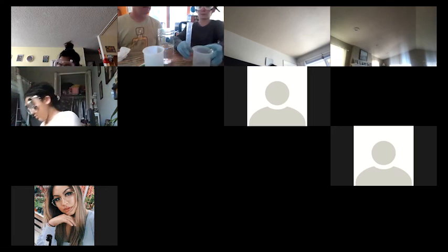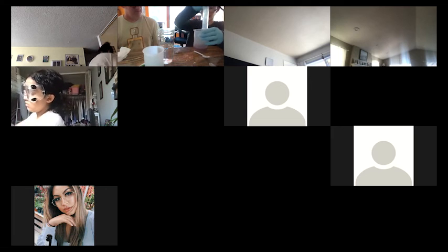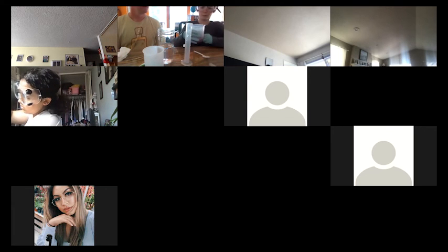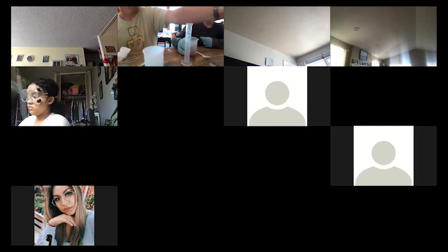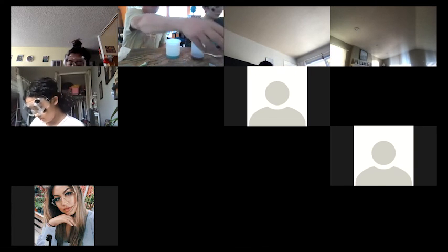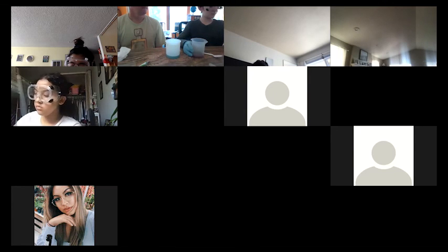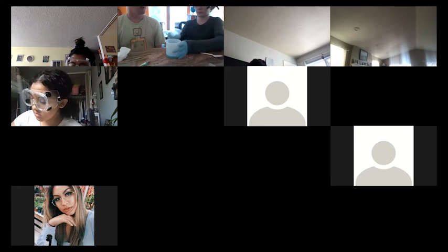All right, so just pour it on top of the copper and just swirl it around. Because we're basically washing all of the salt off of the copper now. And just give it a good swirl. There you go. Okay, that looks pretty good. All right. So let's decant it again. Okay, we'll filter it in a second. We want to do 2 washes.